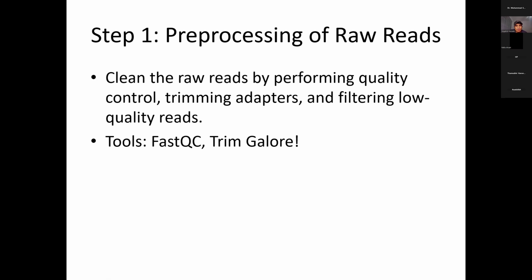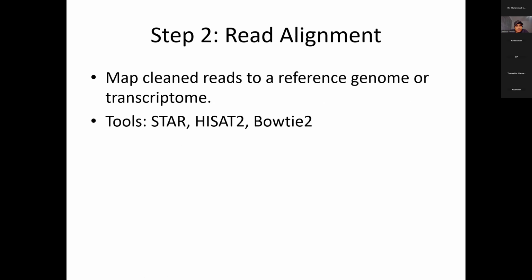Another thing: when we are doing short read sequencing, adapters are attached to the small fragments. So we also need to remove these adapters, and the tool can automatically remove the adapter sequences. The next step is alignment. So I am going to share the whiteboard again.